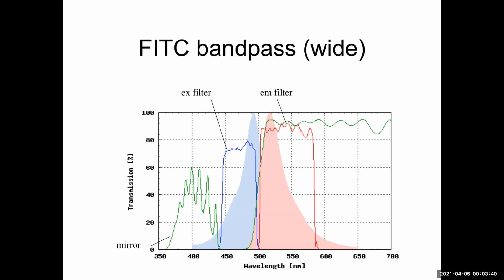Because remember, your specimen is emitting a variety of colors in response to the variety of colors you excited it with. So the emission spectra is what it is, and those are the possible colors, and you're guaranteed, no matter which of its chosen excitation colors you excite it with, you're going to see a range of colors as your emission colors.